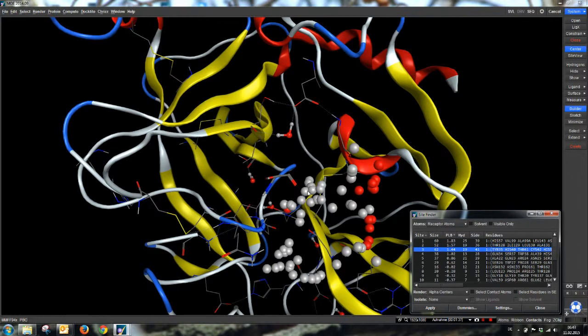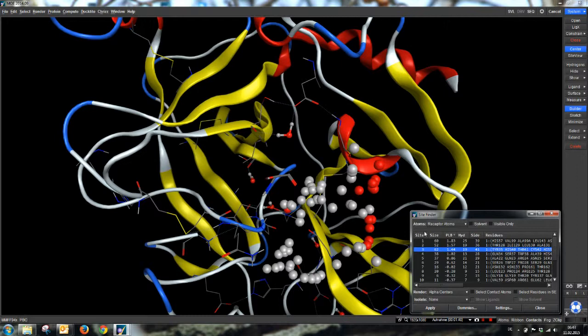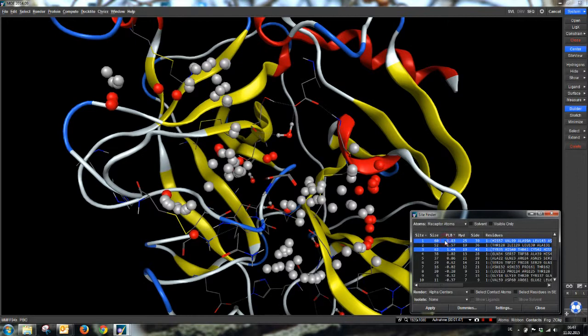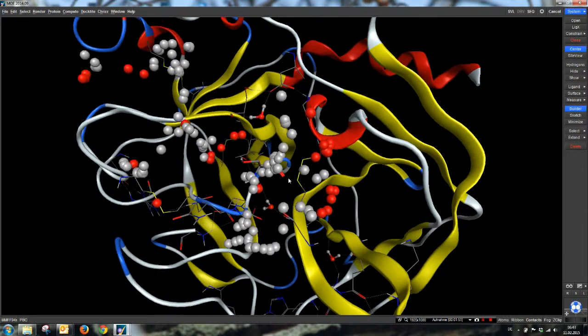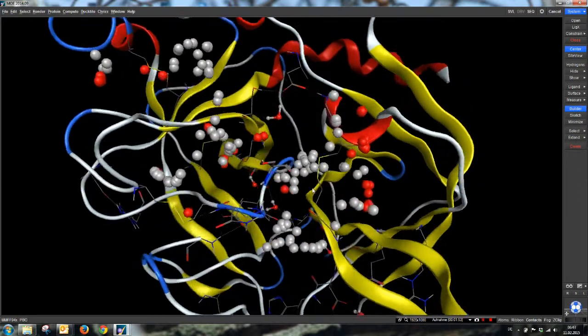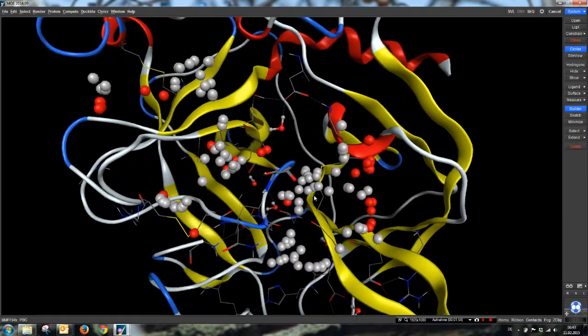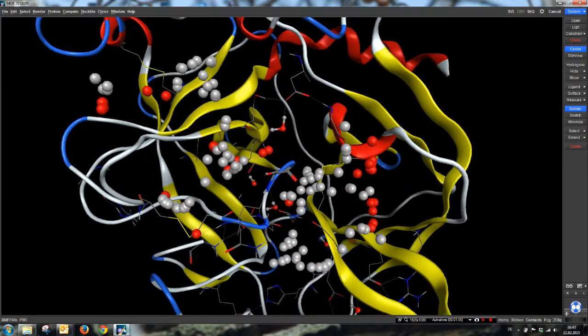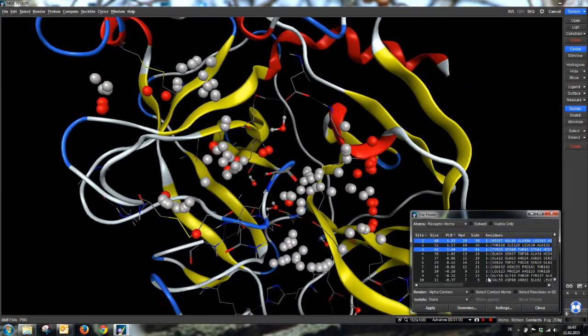And the third one is again around the serine residue, now on the other side of the serine residue. As we don't know exactly where our ligand will be docked, we use both of the sites. We have now a very nice surrounding of our serine residue.